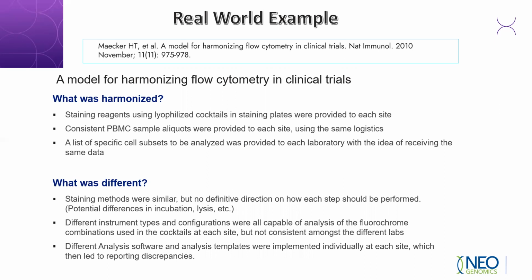There are software packages available from manufacturers to set up the instrumentation. However, they do not necessarily address harmonization across different cytometers and different sites. There will always be differences in performance between different cytometer types and within the same cytometer type if the procedure is different in setup or configuration. And simply using the same reagents along with the same instrument type with the same configuration within and across locations by itself is still not enough to ensure standardized results.